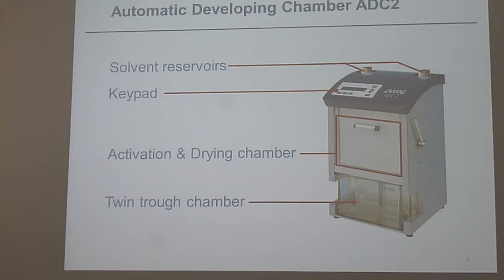And the thing is, here it also has to be reproducible. So if it is always the same, it is okay. The problem would be if they had two chambers and switched them. It could be, but it is something you really have to think about before telling a customer, okay, now you have switched, we don't know which one. It is really a small influence, but it is an influence actually. So the two inlets we have already seen.